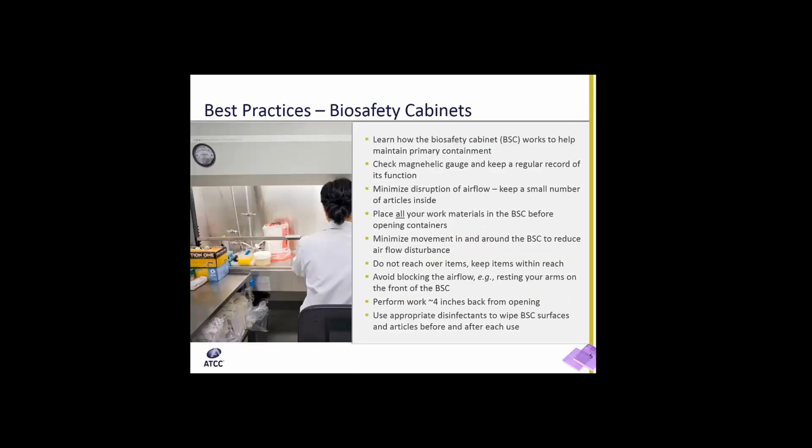The very first area that I want to explain on best practices is biosafety cabinets. First, we have to learn what the biosafety cabinet we have in the lab is and how it works to help maintain the primary containment. All biosafety cabinets must be certified when installed and whenever they are moved, and at least annually. Begin work by first checking the Magnehelic gauge to ensure that it is working correctly, and keep a regular record of its function. Minimize the disruption of airflow by keeping only a small number of articles inside.